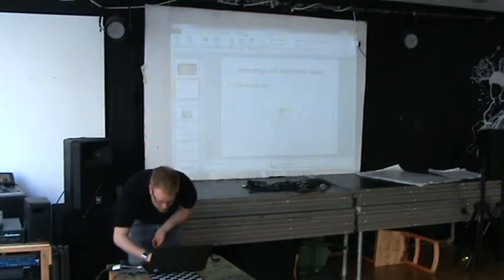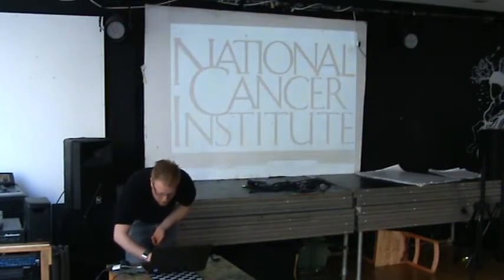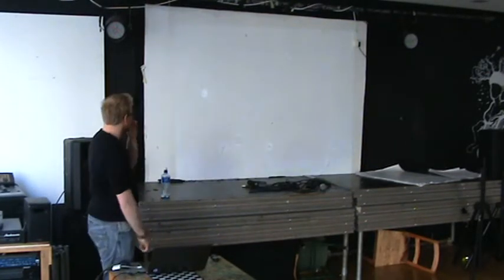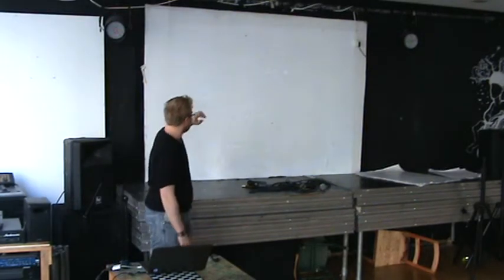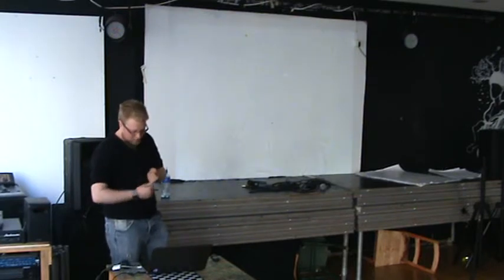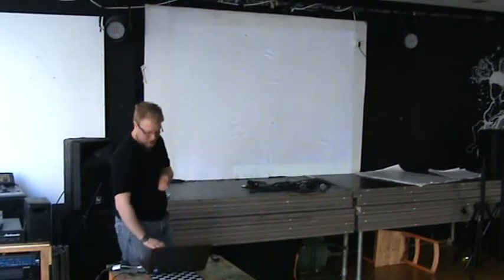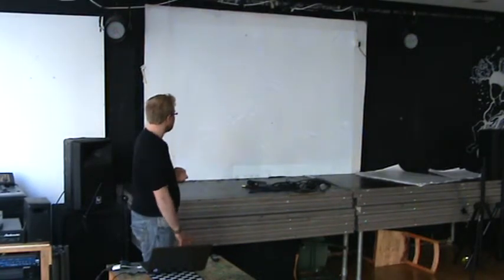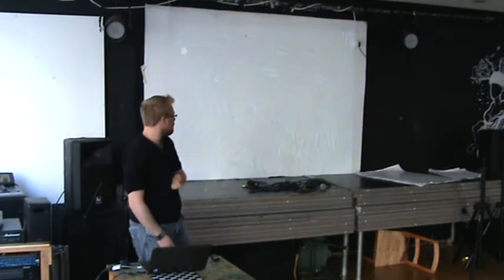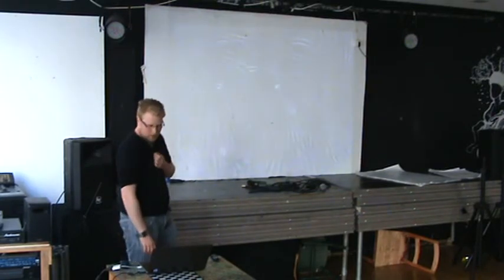So that's that. Oh yeah, and I'm going to show you what these cells, what cancer cells, or maybe your cell culture, will look like when you look down a microscope. So these are normal cells, and you can see, it's not the best video here, but they're dividing slowly, just growing normally. I can actually speed this up. This is what a non-cancerous cell culture looks like. That would be very difficult to use, because over time you just wouldn't generate enough cells. But you can see this is a cancer cell, so this is the sort of thing we would use.